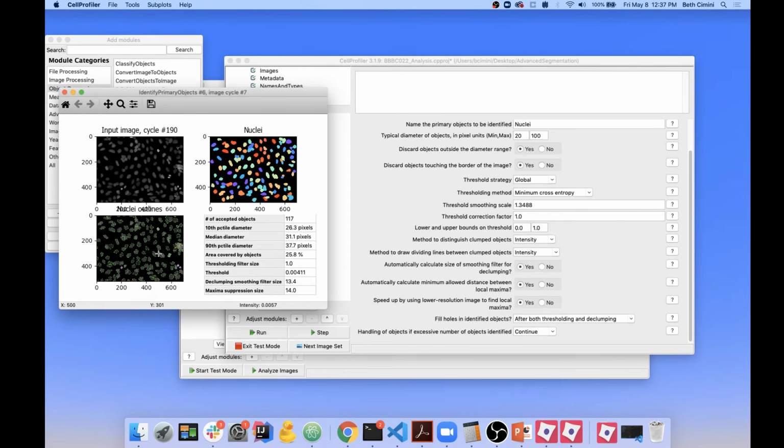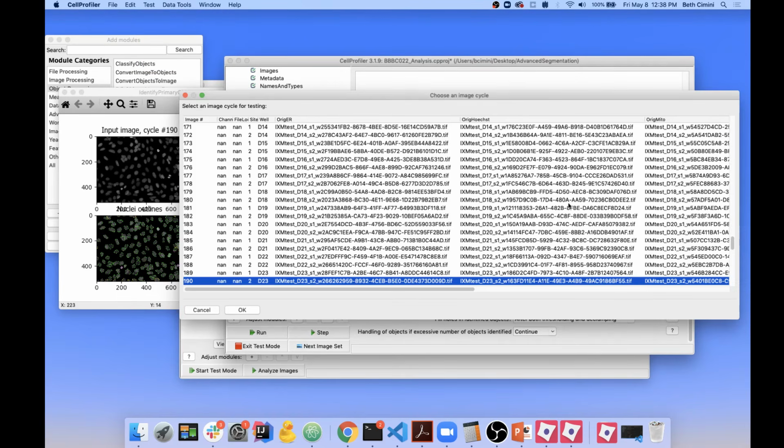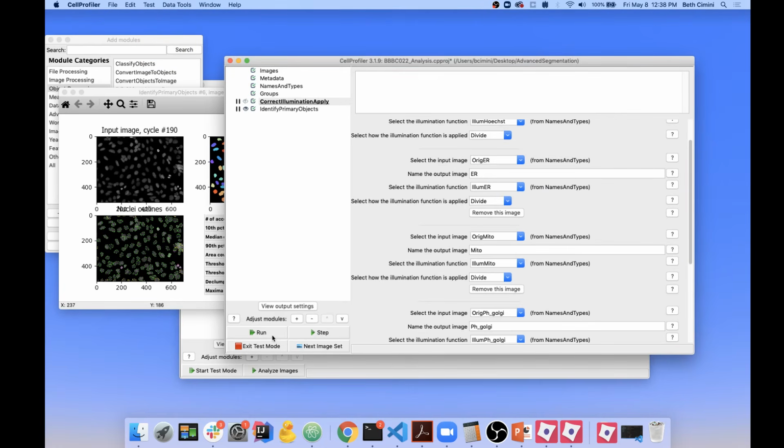And in general, an image analysis pipeline is never going to return 100% the values you want. So when you get to a point where almost all of the image is right, and you have a few things that are being clumped together incorrectly and a few things that are being broken incorrectly, that's usually when I say it's about time to call it a day. And I think these nuclear settings are actually good enough. Though let's double check now on another image. Anytime we make a change here, we want to make sure that it looks good on other images, not just on one.